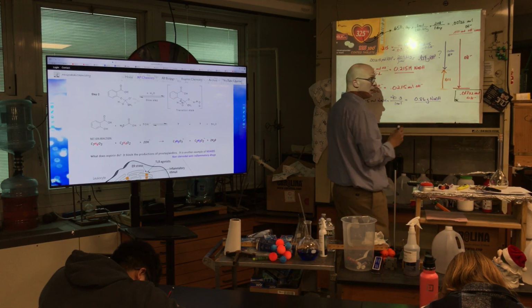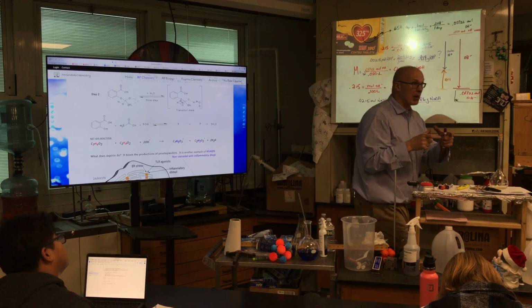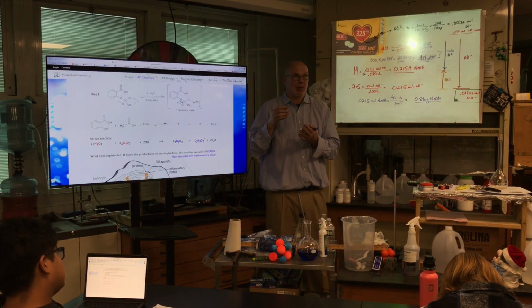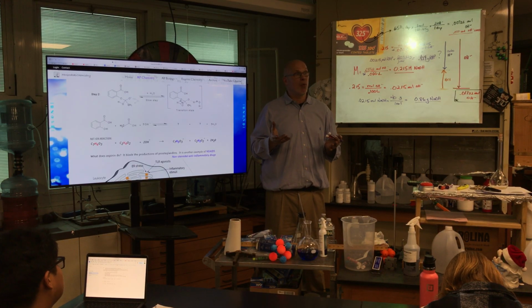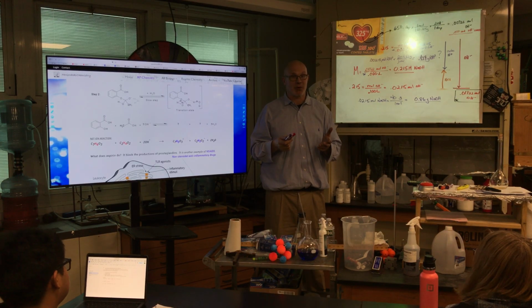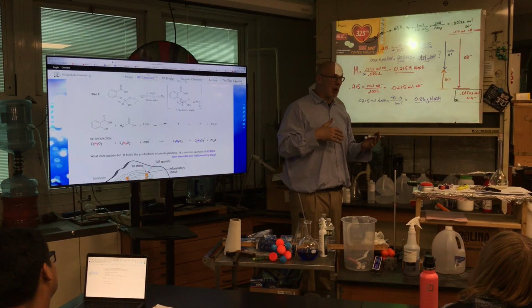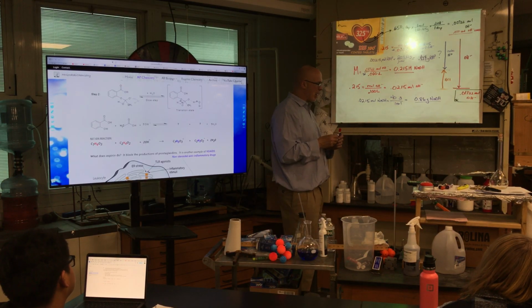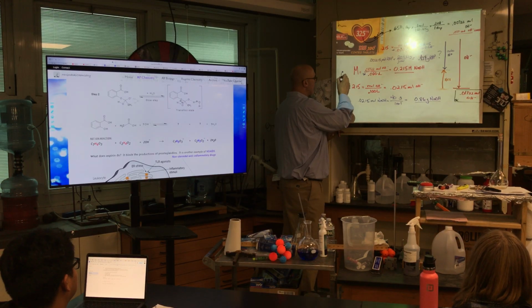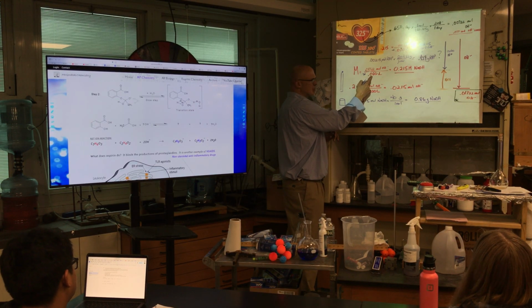What's beautiful about KHP is I'm gonna measure that exact amount on a weighing dish. Spend the time. Carefully pour it into water. Do I care how much water? I don't care how much water. Will it dissolve? It's got a group 1 ion. So I'm not gonna worry about liquids. And that's gonna be my analyte.